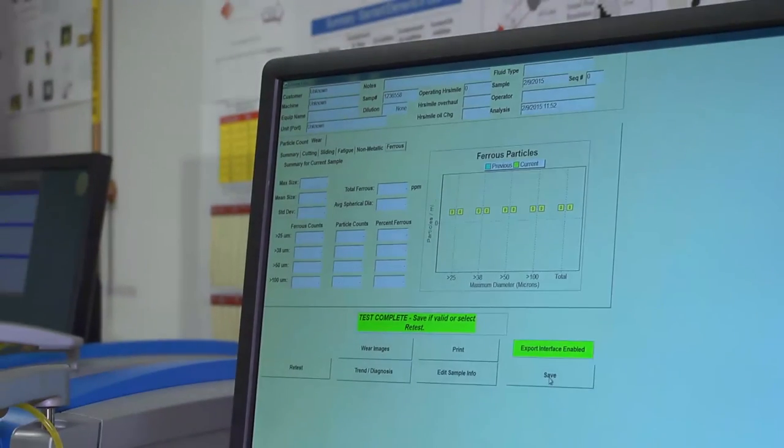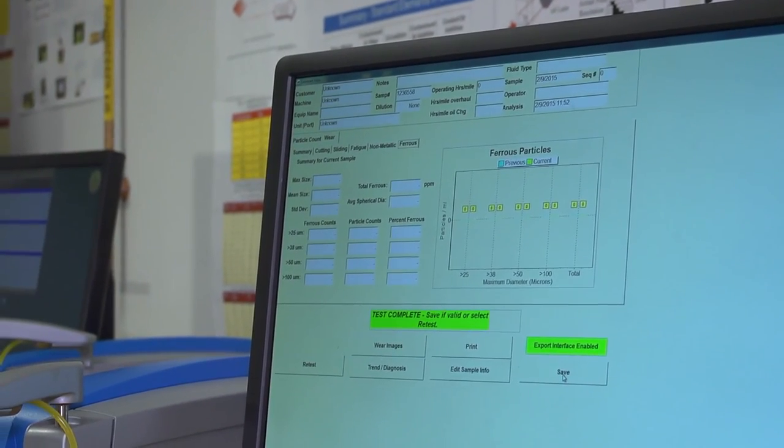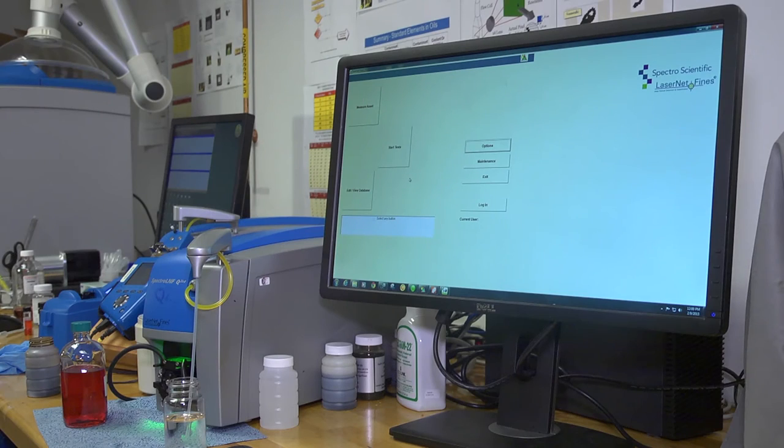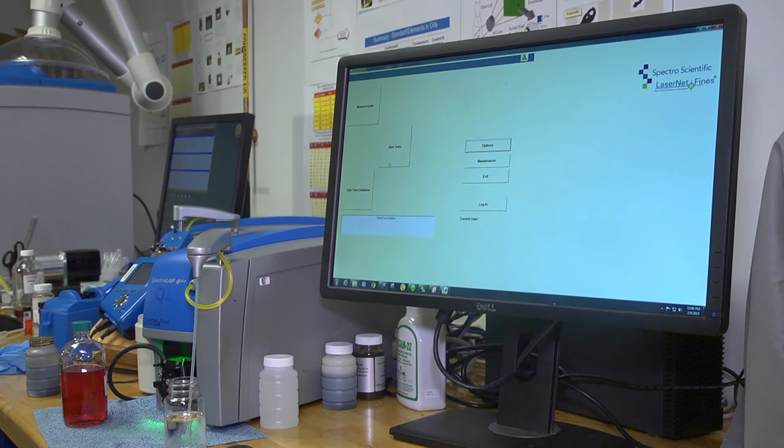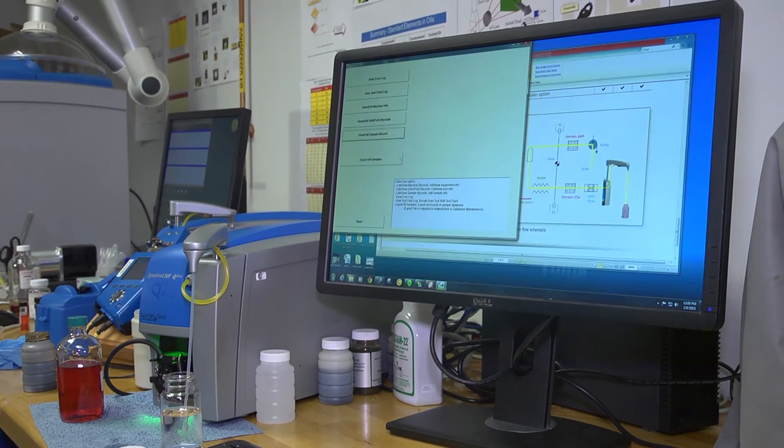If I like the results of the test, I think they're reasonable, I can click save. So we can look now at how to get data out. You can generate a standard report, and to do that we'll just pull up a sample.